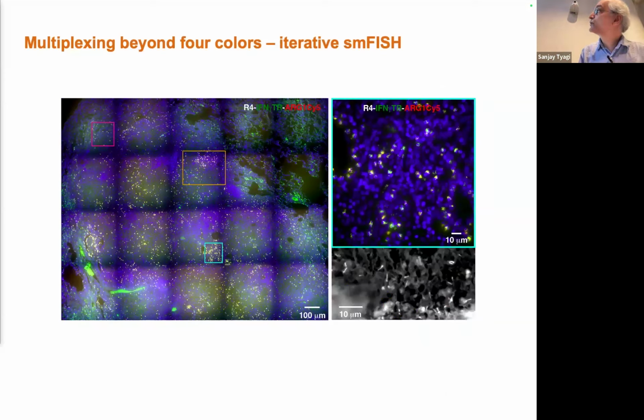If you look at high power, that region of yellow, you can see 2 kinds of cells, some red, some green, some both, showing expression. You can also look at TB bacteria by the auramine stain in part of this.